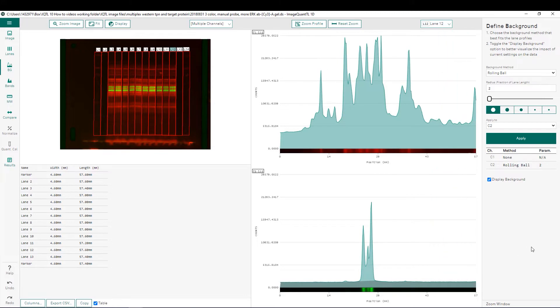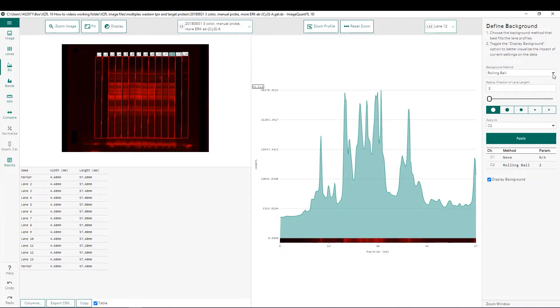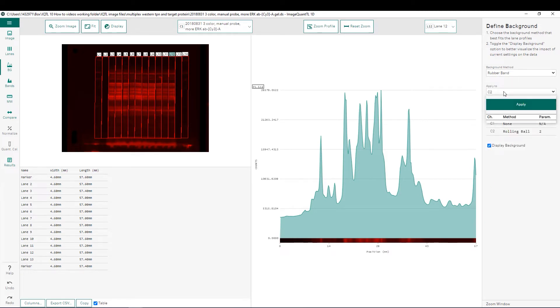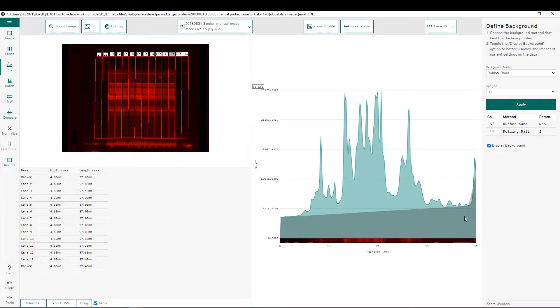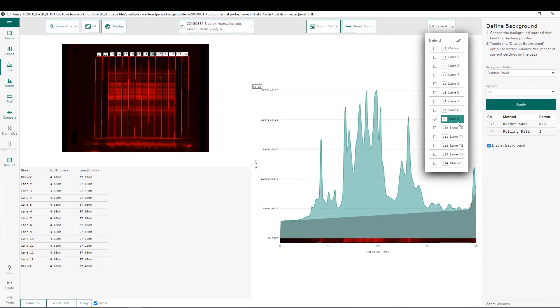Next, for the background subtraction of our total protein normalization channel, I choose to display just that channel to more accurately show what I'm doing. From here, you can choose which type of background subtraction to use. In this case, I'll choose rubber band, which is my preferred method, and apply it to just channel one. Once applied, we can verify how that background subtraction was applied and check consistency across different lanes by choosing to display different lanes.